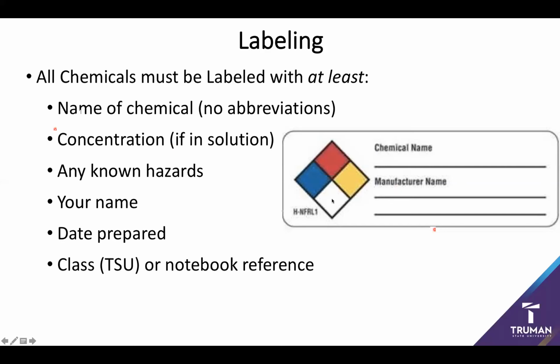If you're preparing your own slides, make sure that you have enough room to provide at least this bare minimum of information. And yes, this means that your labels may be a lot bigger than you'd prefer them to be, but it will keep everybody safe in the long run.